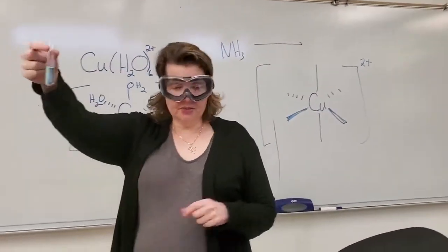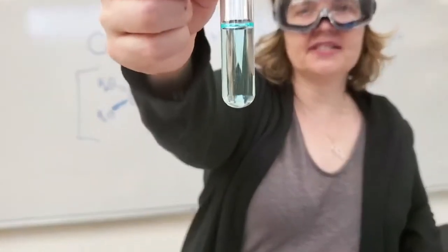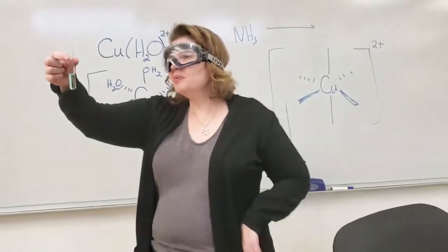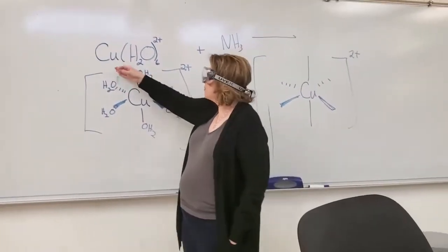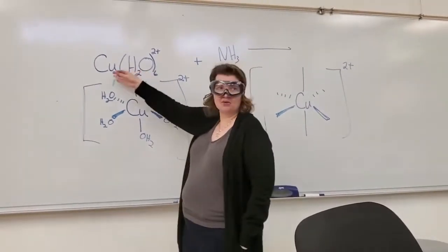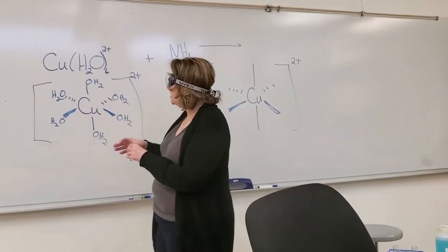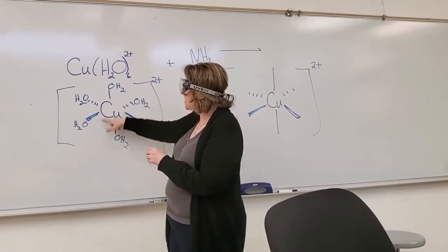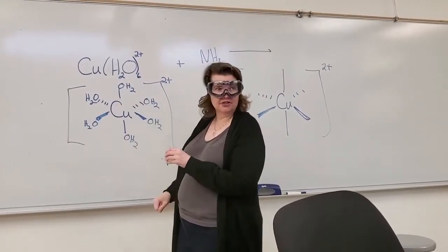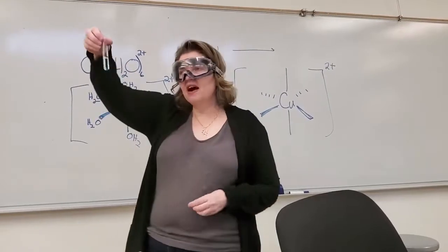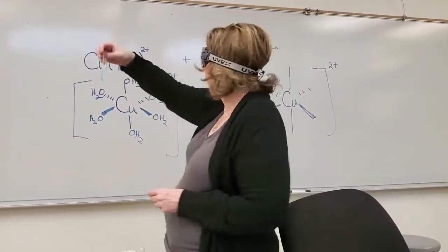I'm going to start out with copper sulfate. Copper sulfate is this pale blue, and when we look at copper sulfate in water, you can't neglect the fact that the water actually does complex. It's a good ligand for the copper. Copper has a coordination number of six and makes an octahedral geometry. So we think copper ion, but it's really a copper hydrate complex.